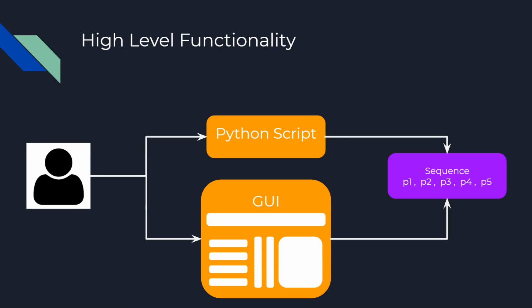The first is a class, and this class contains a variety of different methods that enable users to use the Eugene functionality in a Python environment. The second component of GenePy is the GUI, and the GUI runs on top of the class and enables users that don't have a strong programming background to still be able to explore the GenePy project.